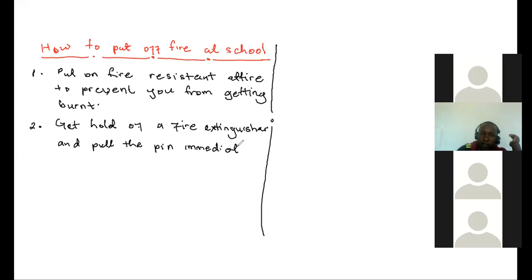Hopefully members are writing. So after that, you're going to direct the outlet at the base of the flame.